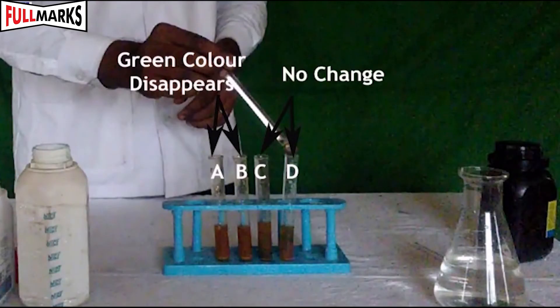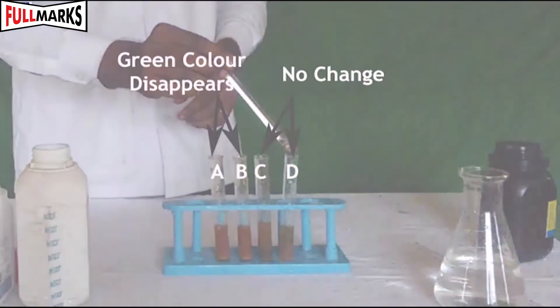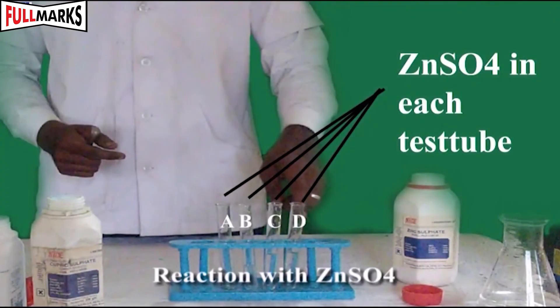In test tube A, the green solution becomes colourless. In test tube B, the green solution also becomes colourless. In C and D, there is no change.